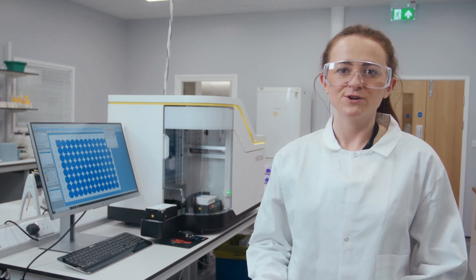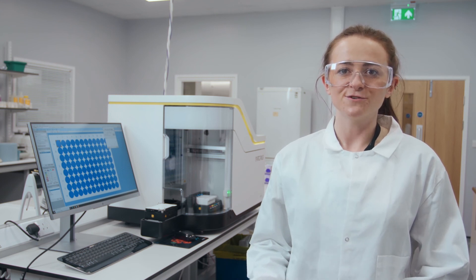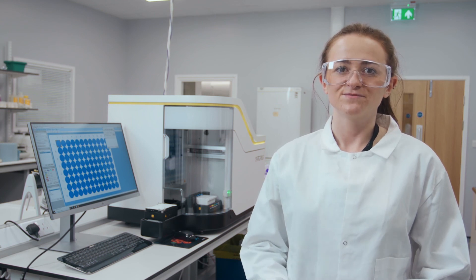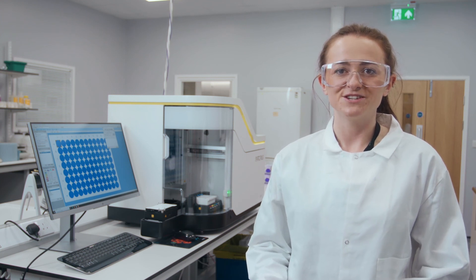This demonstration provides a brief overview of the IQ3 and how the instrument, reagents, and software can be used as part of a cell line development workflow. For more information, visit our website and check the various links to protocols and application notes.